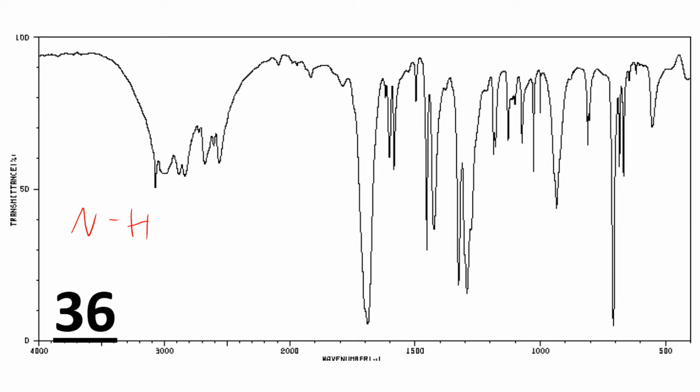And you can just go ahead and tell me absence of a peak at 3300 to 3500, or 1000 to 1250, or 2850 to 3000, or 1550 to 1640, or 1590 to 1650, that being all of the locations from the table. If there's no nitrogen present from the mass spec graph, you will already know that there shouldn't be one on the infrared graph. So first we look for the presence or absence of that nitrogen. This graph, it is not present.